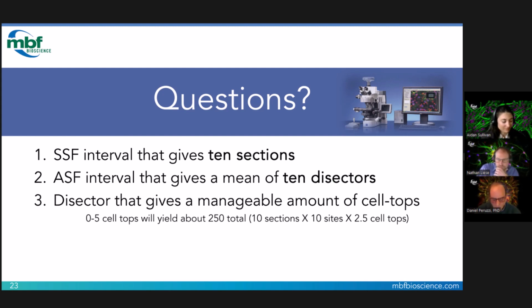And this is true too. Let's say you have a ventricle in the middle of your region. It's okay to make the counting frames go over that ventricle, and you'll be adding 0, and that will not affect your count. Of course, if that ventricle is very large, it will affect your efficiency, and so we can do things like exclude nested contours. So if you're talking about counting dissectors where there's 0 cells, that's okay. Of course, they can't all be 0. We want a mean of about 2 or 3, like 0 to 5 if possible.